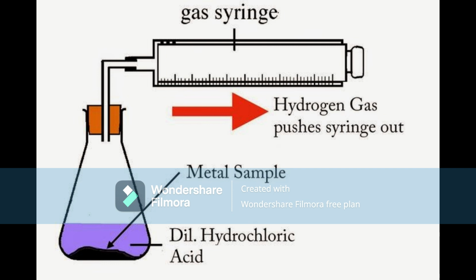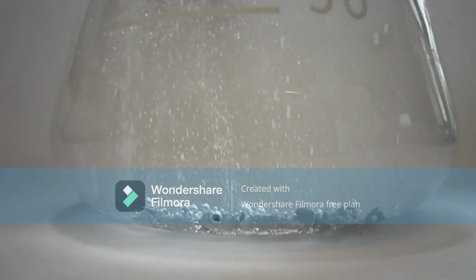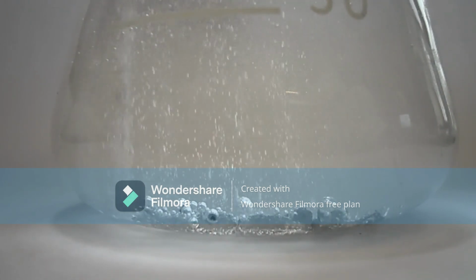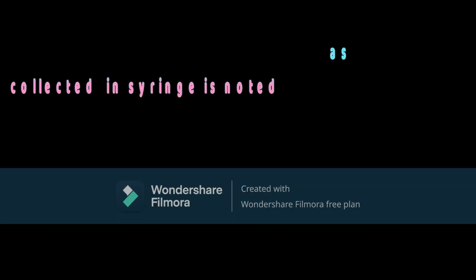The moment you put the magnesium metal into the dilute acid in the RB flask or conical flask, you have to start the timer immediately. What happens initially? Immediately the hydrogen gas starts forming. A lot of hydrogen gas is produced, so that will go and collect only in the gas syringe. It has no other space to get collected. The gas syringe initially, without reaction, has nothing collected. After the reaction it will increase in volume.